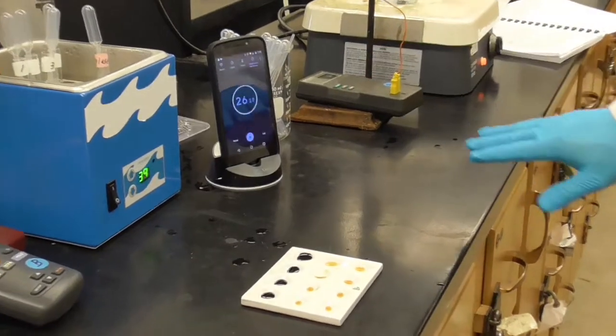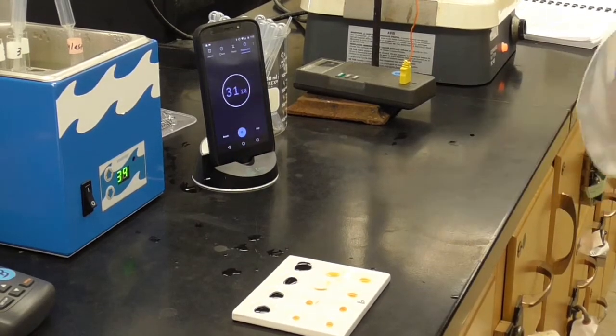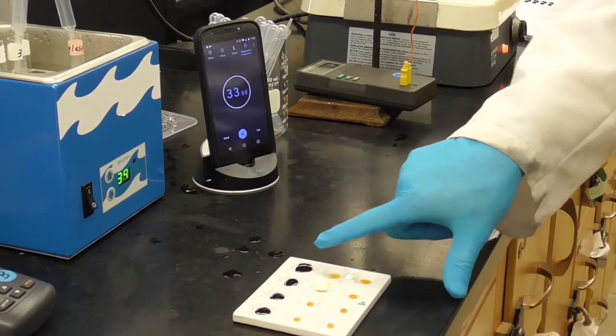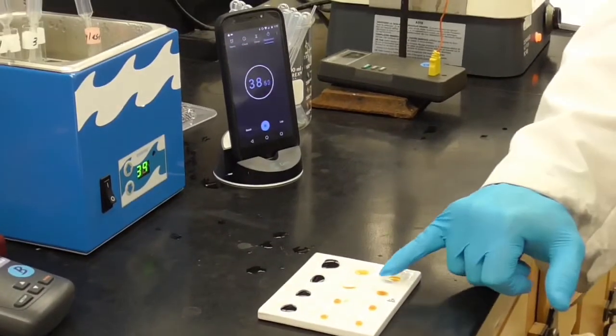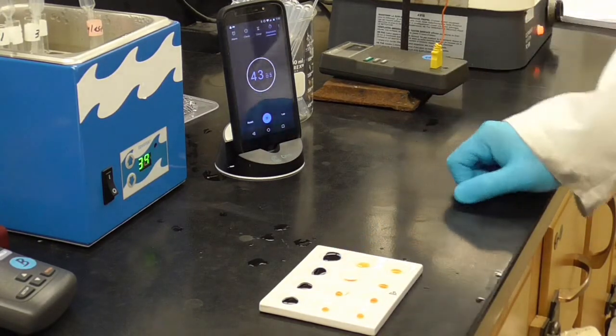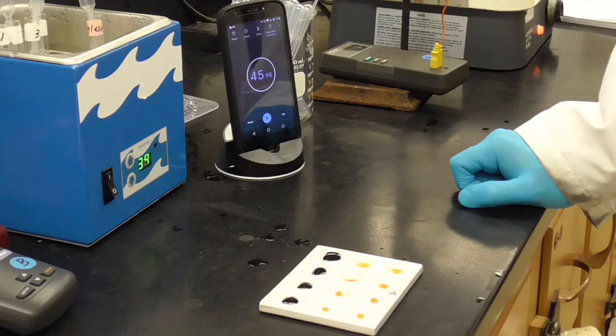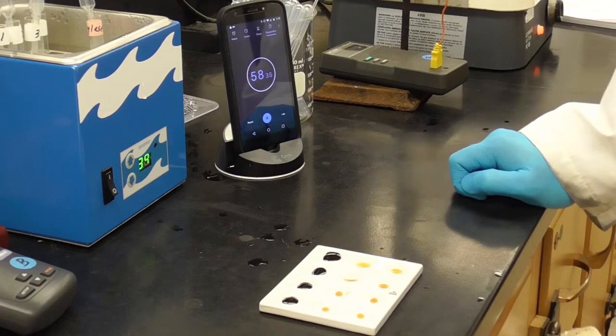While we're waiting for 4 minutes and 30 seconds to go along, why are they all the same at this point, and what does the color mean? You can see that all 4 test tubes have a nice dark color to them, right? That dark blue, blackish almost color. That simply means that there's lots of starch. The starch is present, it is not broken down. Remember, that iodine is an indicator for that starch, and it's kind of cool when you drop the clear liquid onto an orange drop and then all of a sudden it just turns dark blue like that. But that's chemistry, that's why I love chemistry. So that is evidence that starch is present.